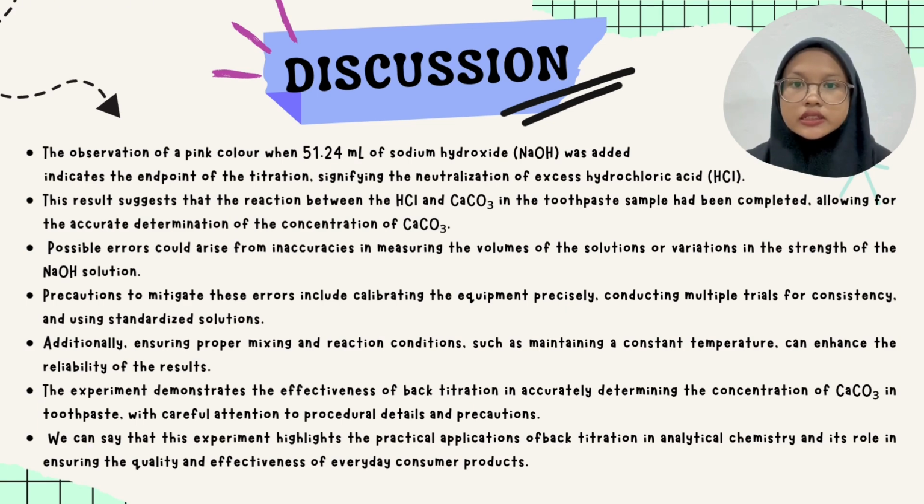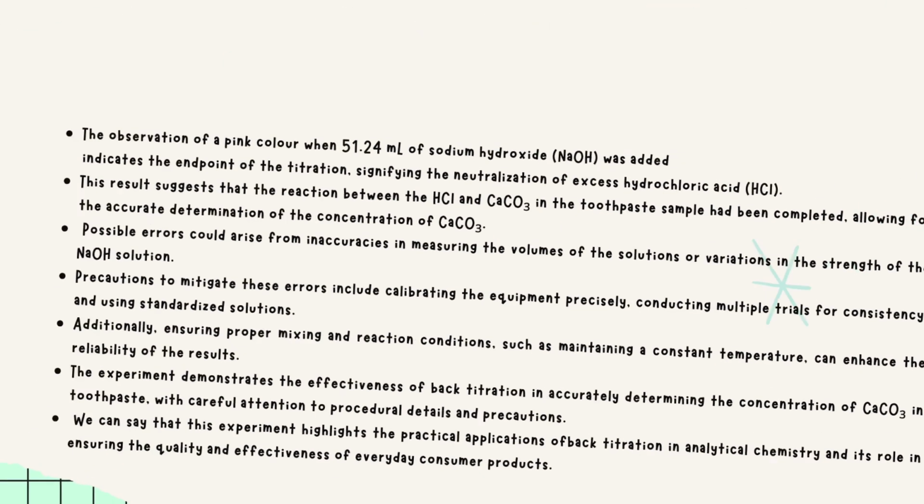We can say that this experiment highlights the practical application of back titration in analytical chemistry and its role in ensuring the quality and effectiveness of everyday consumer products.